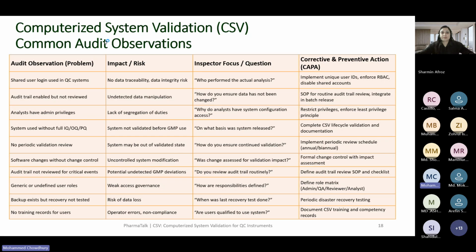What was mentioned was whether admin control is supposed to be reviewed by a third party or not. Is it mentioned in any regulatory guideline or regulations? No, such things are not mentioned in regulatory guidelines, that it is supposed to be reviewed by a third party outside of the company. It is under the complete discretion of the company.